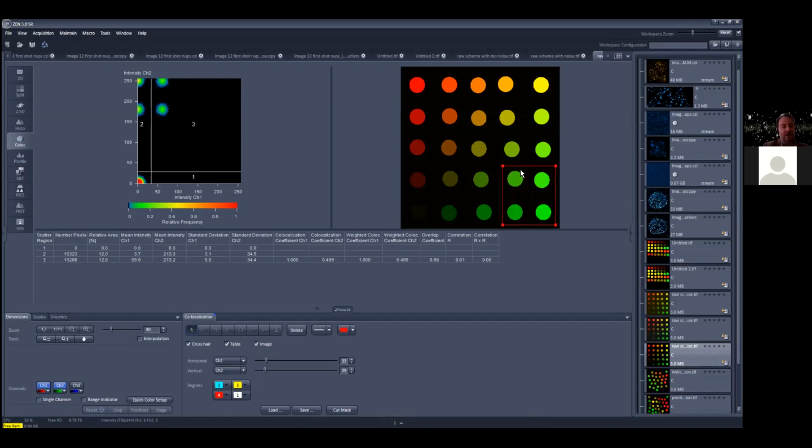If I increase this thing, the area becomes smaller. And you see here now I'm starting to populate different quadrants. If I do it like here, I will now have objects in all the different quadrants. Because the circles are all the same size, the number of pixels will be similar, 7,860. And the relative area relative to that box.